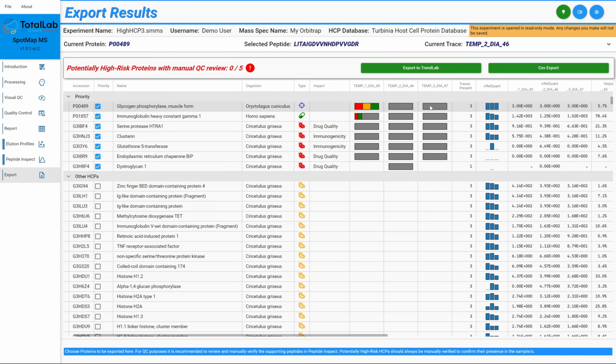So by having this contextual automation, these great reports, this brilliant color coding system and graphing quality, we've taken something that would normally just be a spreadsheet full of numbers. We've given it context, we've linked it to where we think the danger lies, and we've provided a huge number of tools to ensure a high level of quality, because things like this may be going to the FDA or the MHRA, depending where you are in the world and what governing body you're under.